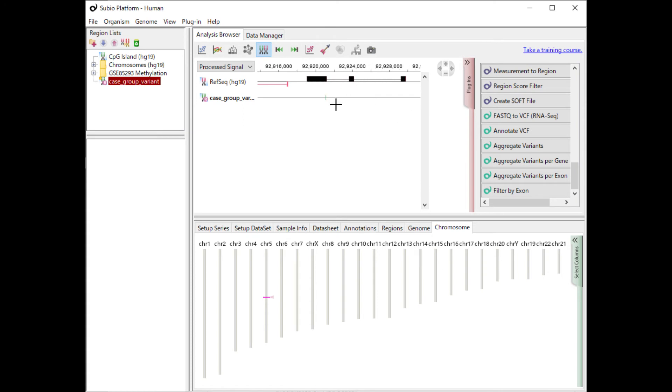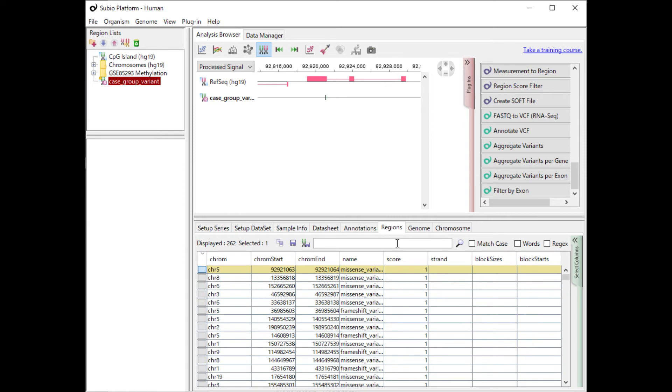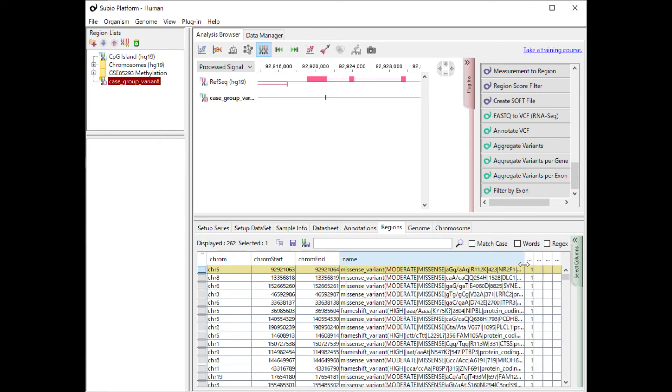If you select a mutation on the NR2F1 gene and look at the Regions tab, you can see that this is the point mutation of R112K.